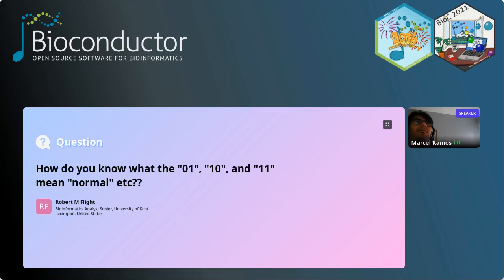We are interested in sampleTypes, so we'll do data(sampleTypes) and then print it. So this is our map that will give us a reference of what the zeros and ones mean. So 01 is a primary solid tumor, 10 is blood derived normal, 11 is solid tissue normal.